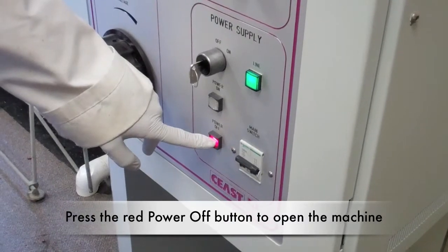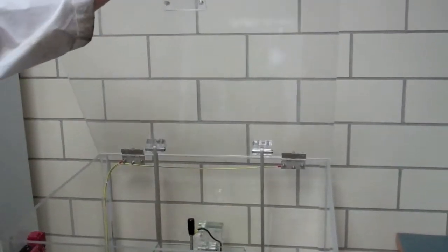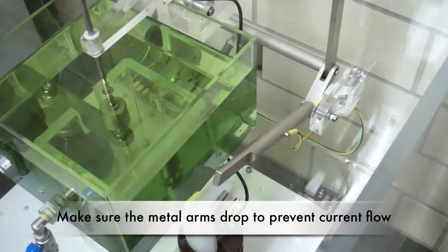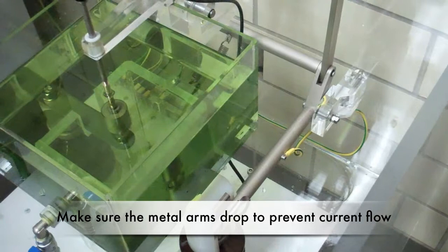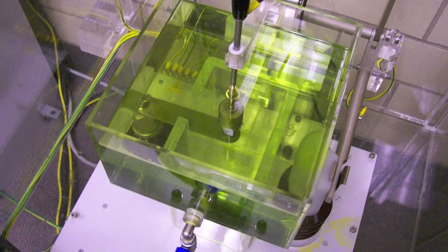To load your sample, depress the red power off button, then lift the lid. As the lid rises, two metal arms will lower, shorting the transformer circuit and preventing the flow of electric current. Do not load the sample until the two arms have been lowered.